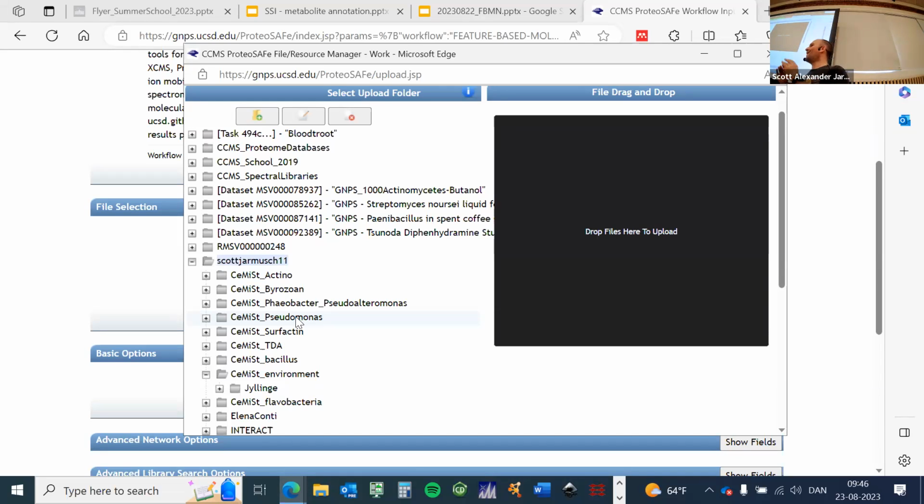Yeah, I know. Who of you is having trouble moving the files into the right place on your GNPS site? So maybe just as a general trick, how to organize your files on your GNPS storage space here. If you want to bring order into that, I would recommend you first generate a parent folder before you upload and drag and drop the files, right? So this you can do through this button here with the new folder, right?